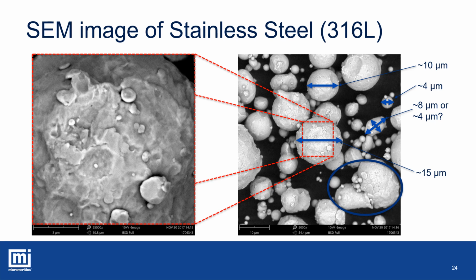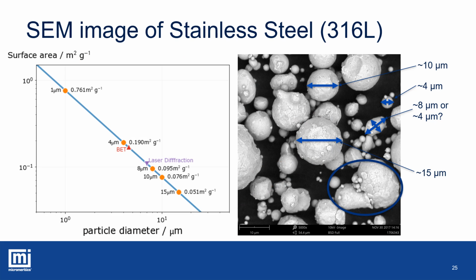Since we're looking at an image, we thought it would be also interesting to calculate some surface area results using the inversely proportional relationship between surface area and particle size on a log-log scale, and see how that compares to the rest of the results that we collected.